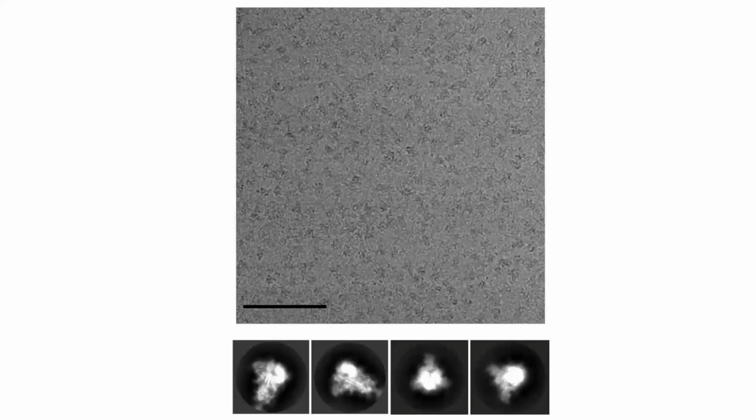At this point, we were working really quickly to get information as quickly as possible. So literally the exact same day that I purified this protein, I handed it off to Young and he froze it instantly. What you're looking at is a continuous thin carbon grid over lacy carbon that he collected on the Krios with a K2.